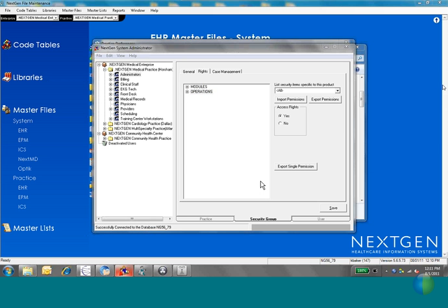All right, I have a question here. We have two vendors, LabCorp and Meditech. The LabCorp requisition prints perfectly. I copied the LabCorp rec and modified the header to state Meditech, as this assists lab. Okay. All right, we'll get there. I'll show you in one minute.